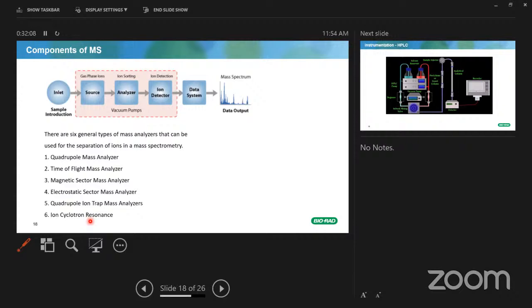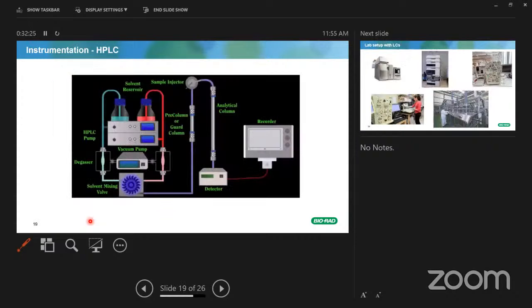So with this, basically we have tried to cover what HPLC with GC is, and what MS is. Now we go to the instrumentation part: what all things are there in, for example, liquid chromatography and also the MS, and how things are coupled. I mentioned the components of chromatography: the autosampler, the pump, the column and the detector. Now this is a more graphical representation of HPLC.